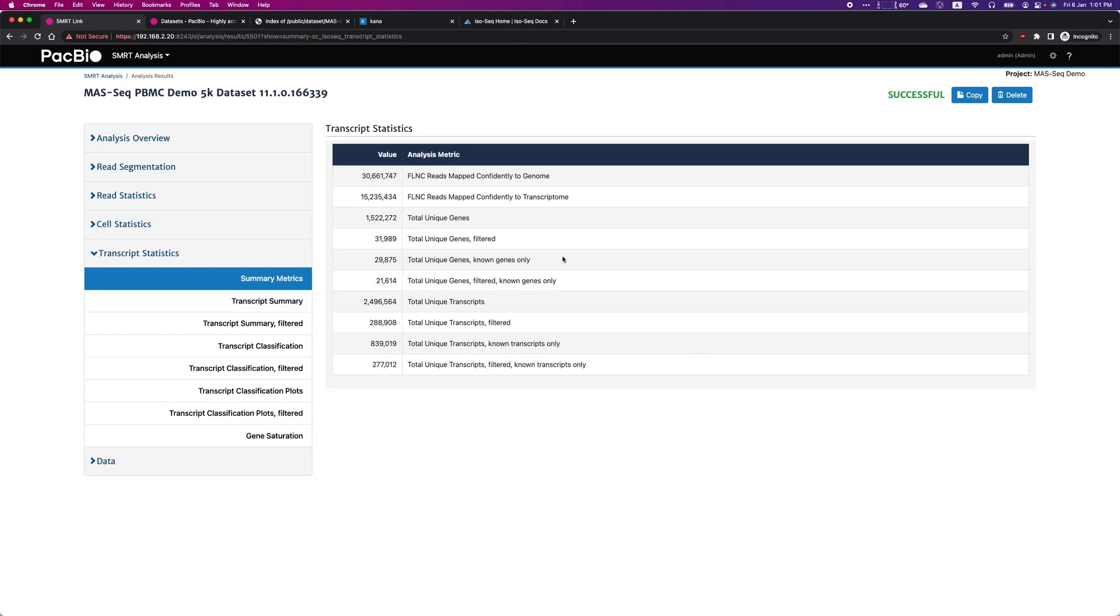Next, let's review the transcripts characteristics. Here, you can see that the majority of transcripts can be mapped to the genome.